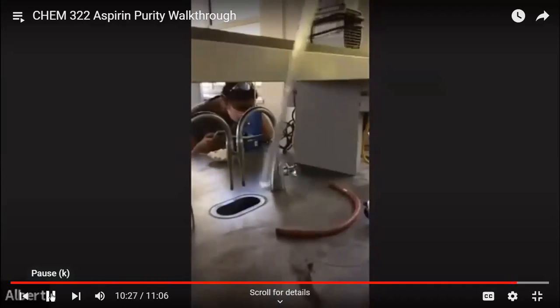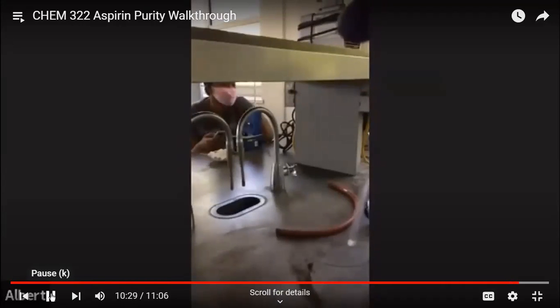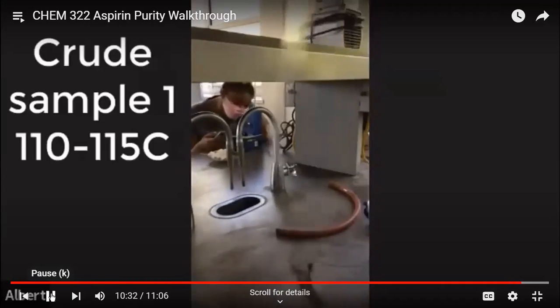And the crude for 11 was started at 110 and ended at 115. So that's okay. So in your data sheet, no matter which sample you're using, because we compared all of our samples to the same crude sample, that's what you're going to put in for the melting range for the crude sample, 110 to 115. All right, that's for everybody, whether you're using sample 1, sample 2, or sample 3. The crude is the same for everybody. And that's for the crude column? Yes. Okay.